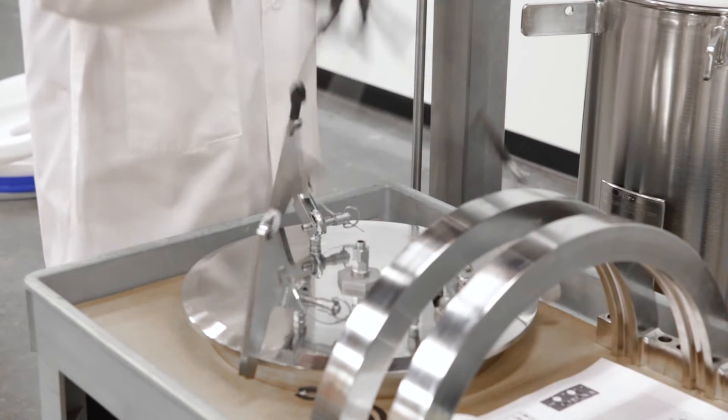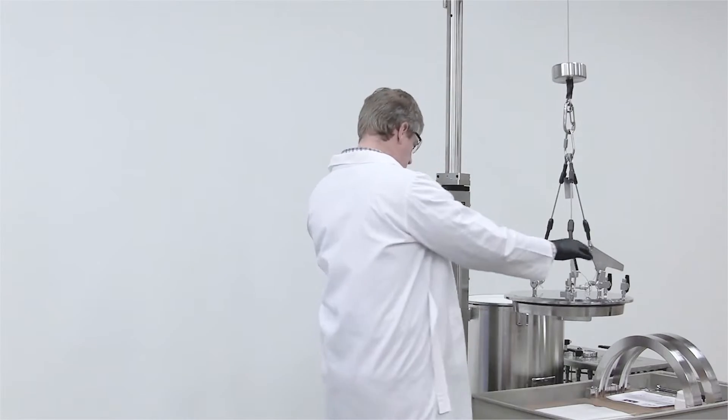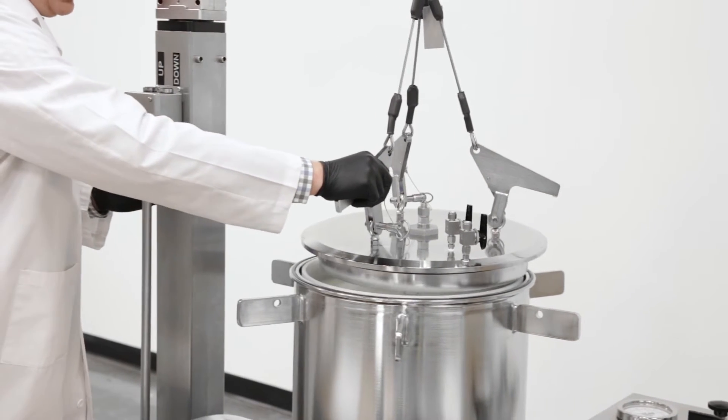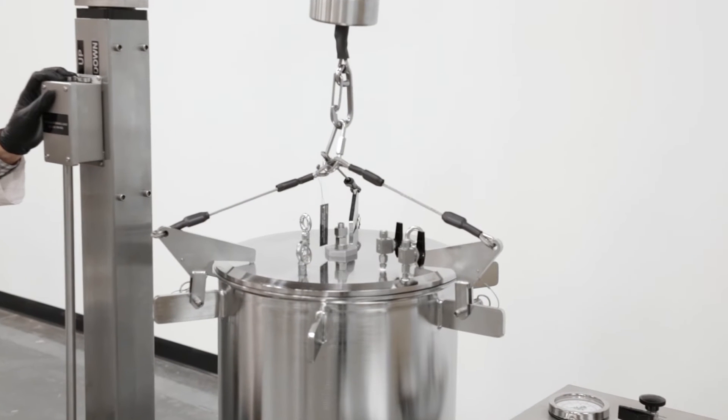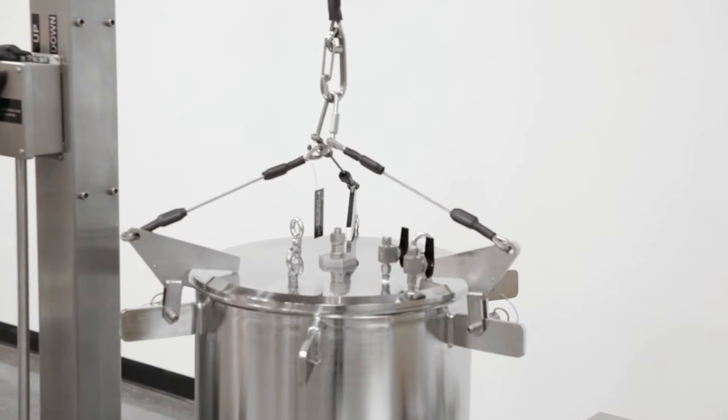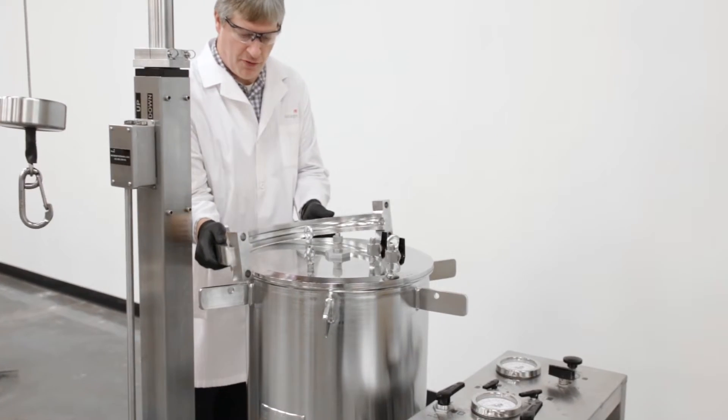The 60 kilogram head, engineered from solid steel, seals the cartridge under pressure. It can be tightened with the force of the hoist and must then be secured with the heavy duty clamps and bolts.